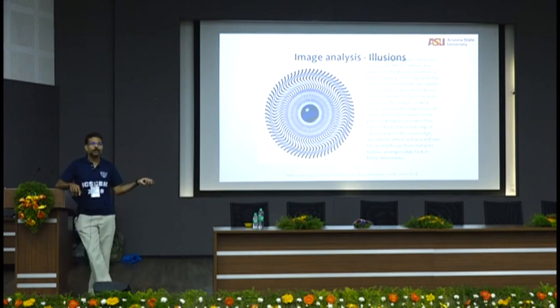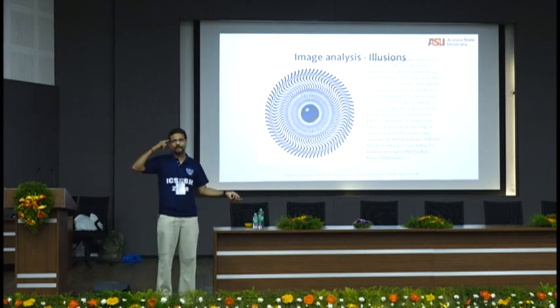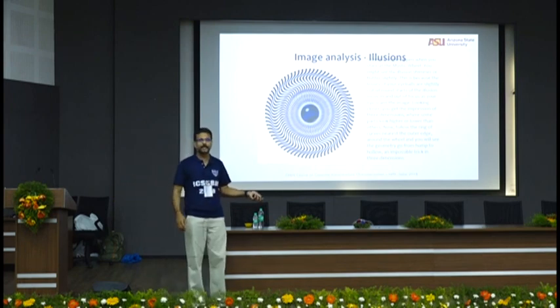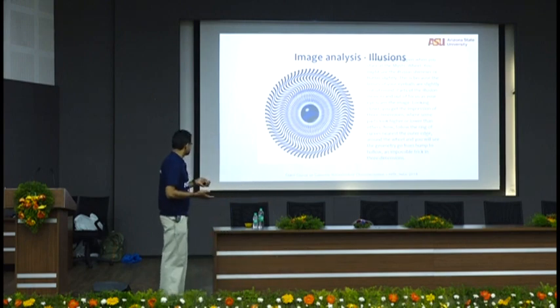What I want to show is that what you see in 2D is a fallacy. What you see in 2D is fake. You have to make sense out of the fake from 2D. Anytime you look at an SEM, tell your mind, I'm looking at a fake picture, I need to create the right impression out of it. Because if you take a 2D of a 3D structure, and I'll show you some mathematical tricks to do that as we go through, what you're effectively seeing is a 2D structure, not 3D.